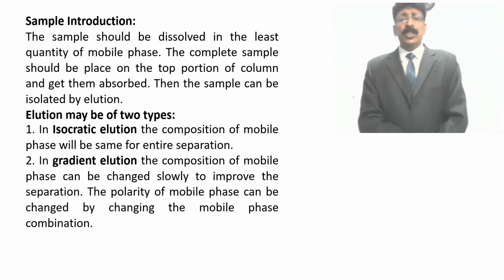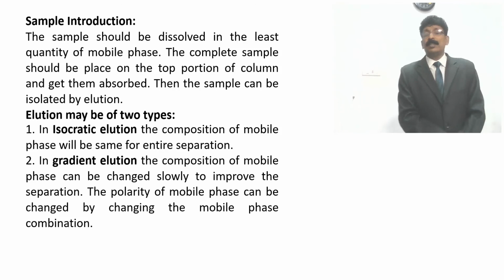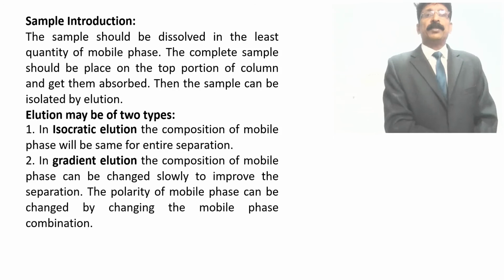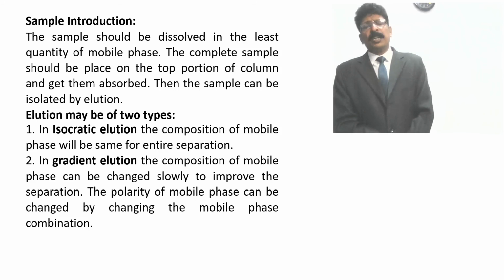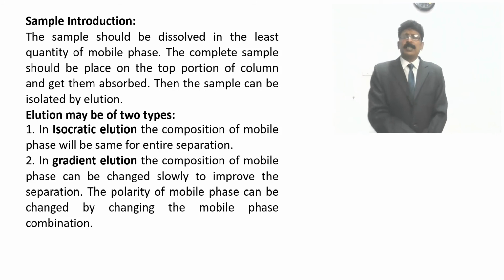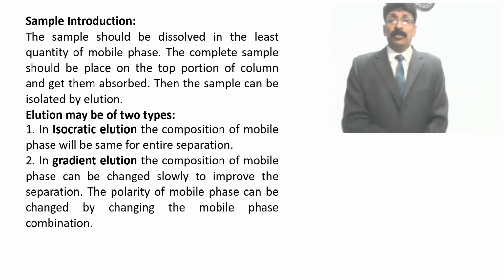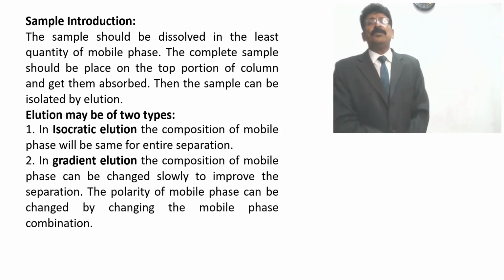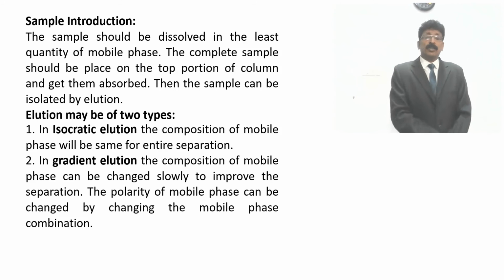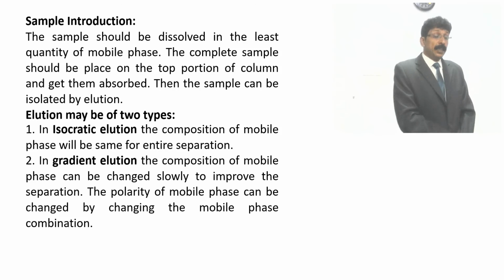Different minute compounds can be differentiated and you can elute them very clearly by means of their affinity towards the stationary phase, if it is adsorption chromatography. If it is partition chromatography, separation is according to the solubility between the two immiscible liquids, the stationary and mobile phase, by the partition coefficient of the solute. These methods can also be used for separating very minute differences in structural variation by liquid chromatography.